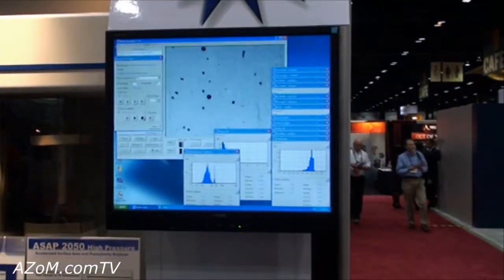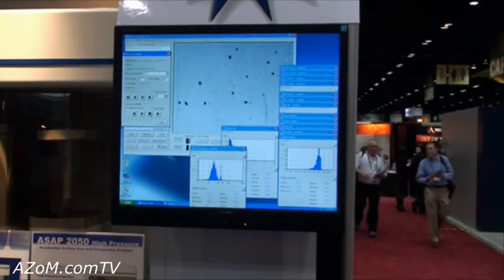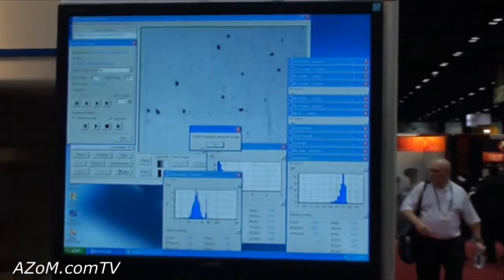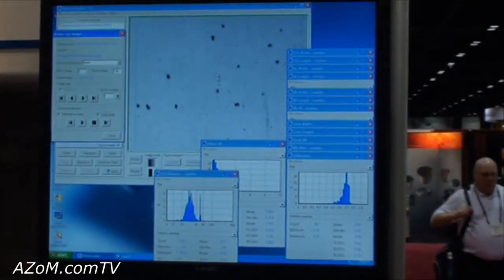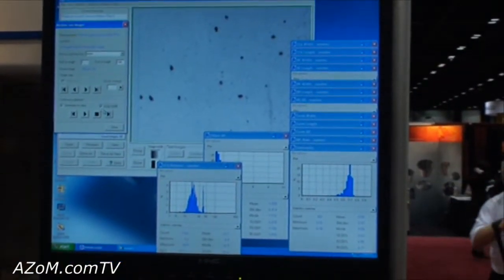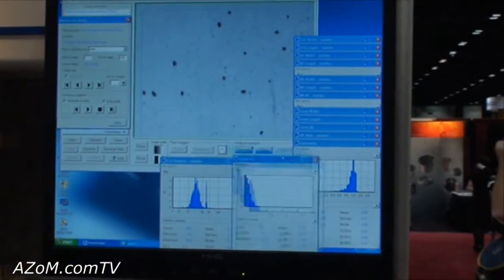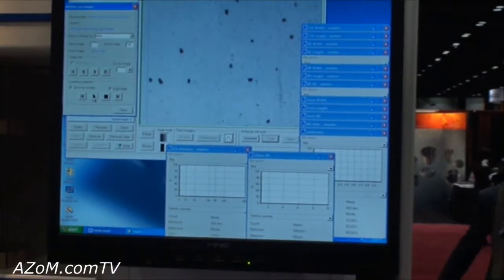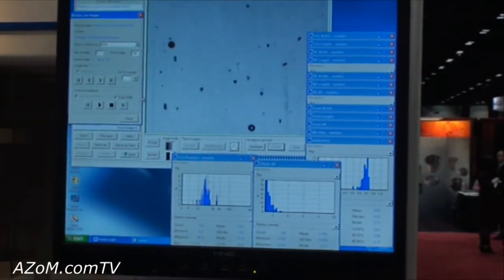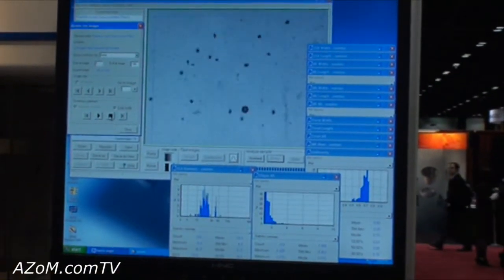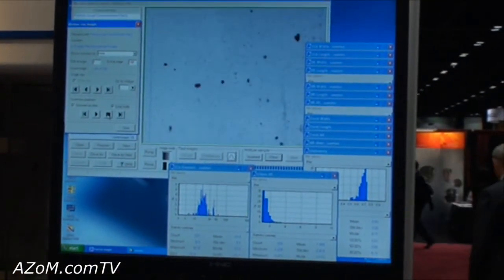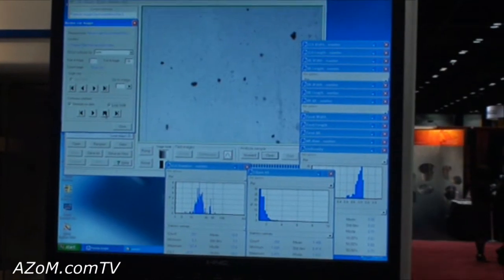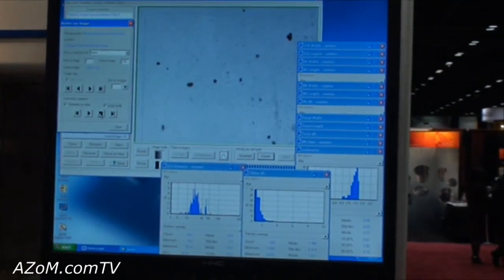A couple of nice things about it. As you can see here in the sample, there are a couple of different types of shapes. We have some shapes that are spheres and some that are obviously not spheres. This instrument has up to 28 different shape parameters.